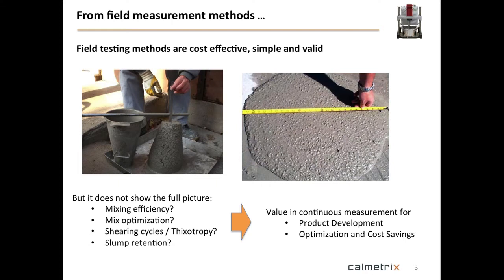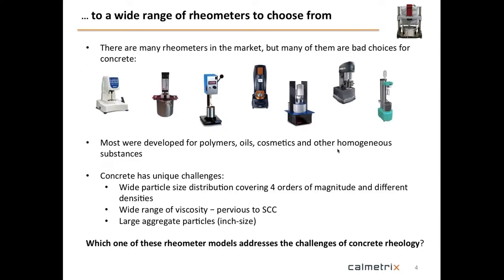And then as you start looking for rheometers, what you will find in the market is a humongously large number of offers that you can get. You have many rheometers available, many more than for other types of instruments. However, what happens very often in the cement and concrete industry is that many lab instruments, I want to say almost all lab instruments, were developed originally for other industries.